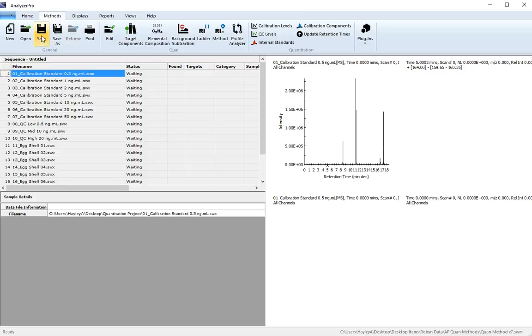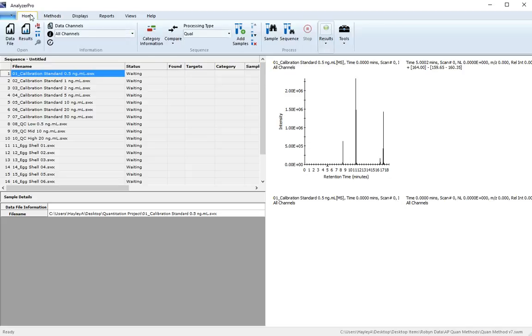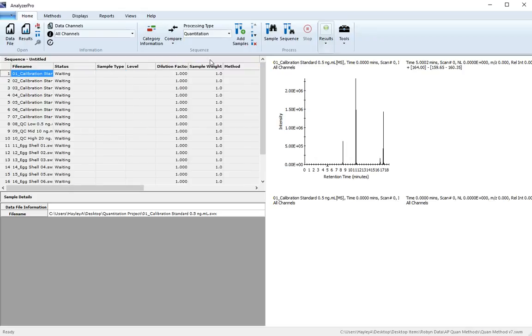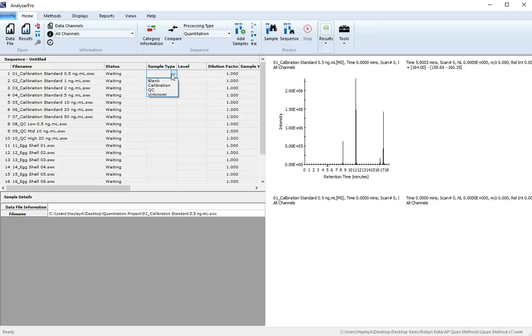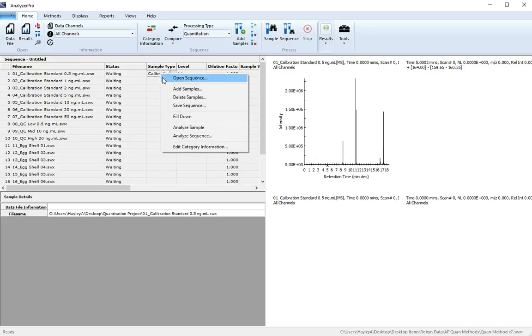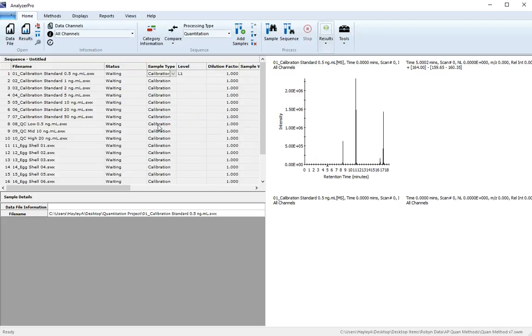With our quantitation method finished, we are now ready to process the sequence. From the Home tab, select Quantitation as the processing type. In your sequence table, you can now fill out the sample types and their appropriate levels. The first seven data files are your calibration samples.